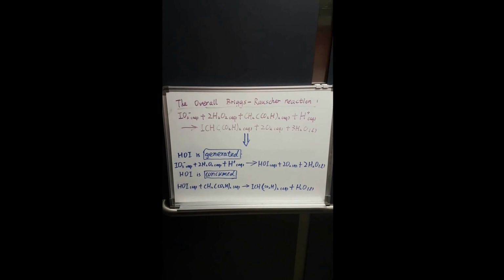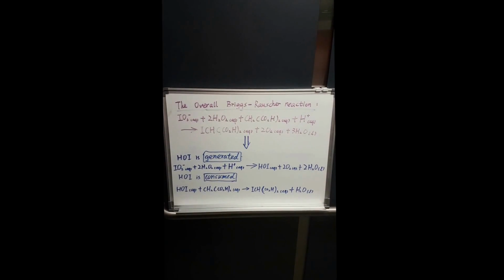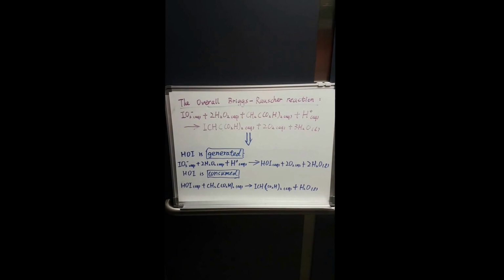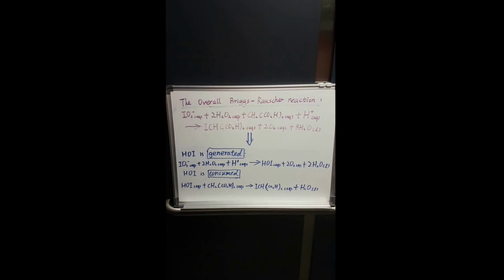So there's two reaction mechanisms taking place here. So there's two reaction pathways. Then both act like a pendulum. So one reaction starts at the top of the pendulum, dropping down and transitioning as the other reaction pathway takes over, bringing it to the top of the pendulum on the other side. Thus, both reactions stay far away from equilibrium.